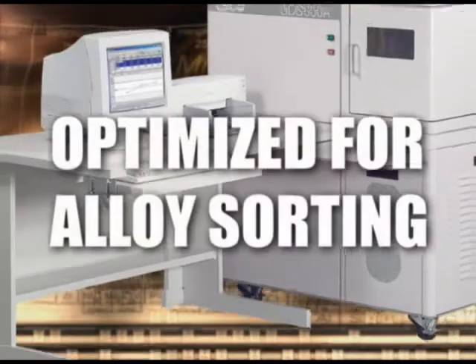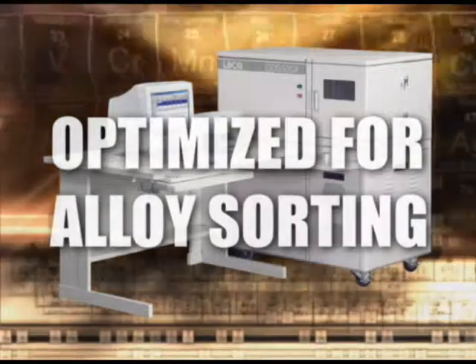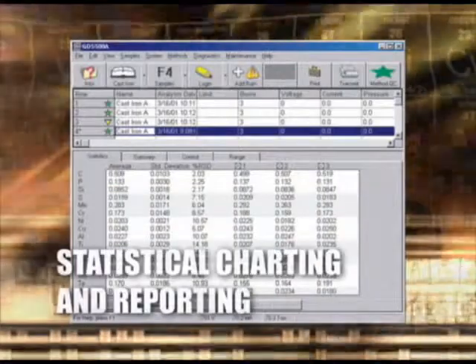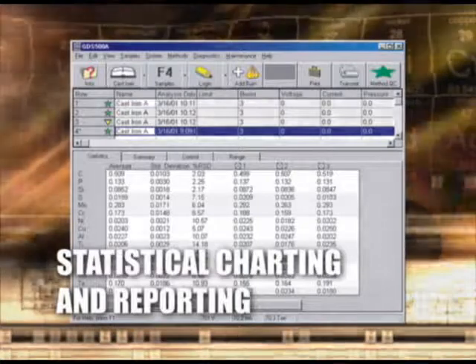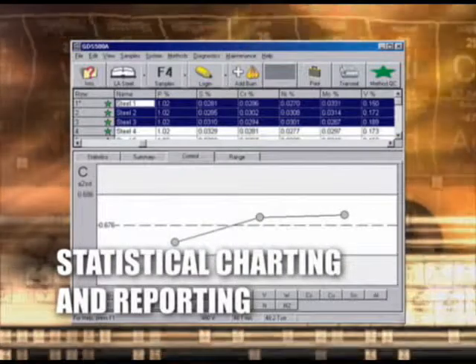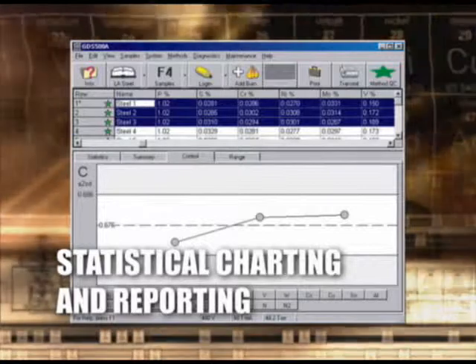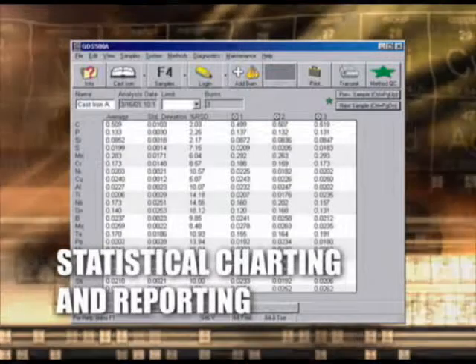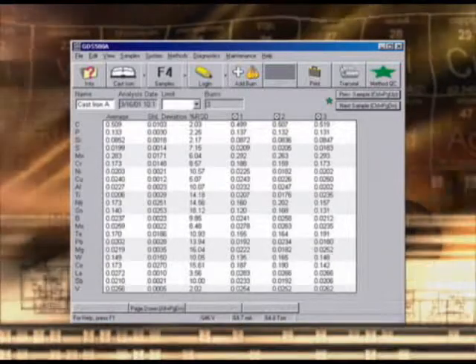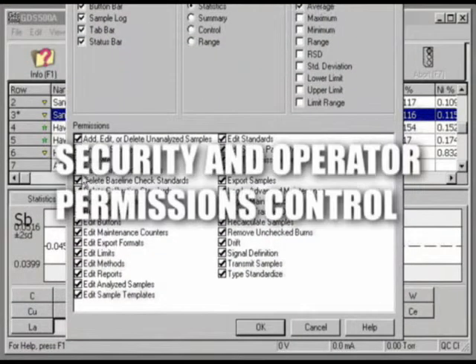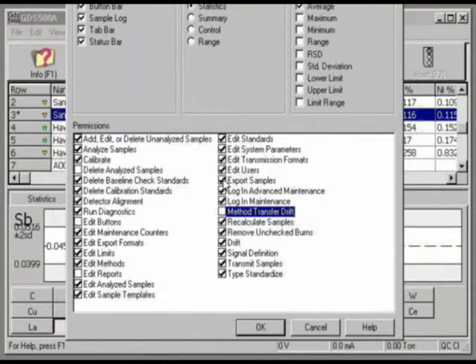The GDS500 is optimally suited for alloy sorting identification. Ease of operation and analytical flexibility are only a portion of the GDS500 software features. Statistical charting is available for sample reporting. Charts can be displayed for each sample showing analysis values with user-defined control limits. A security and permissions dialogue allows the supervisor to assign a login, password, and permissions for each operator.